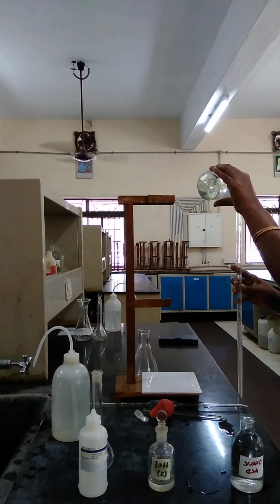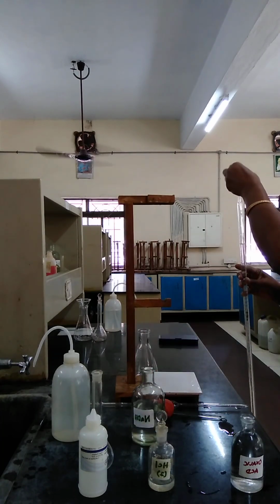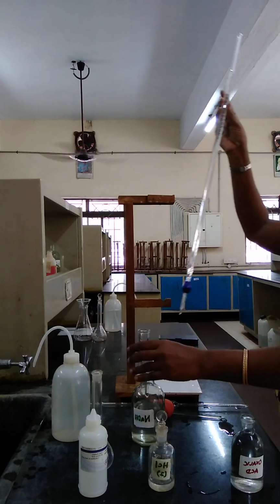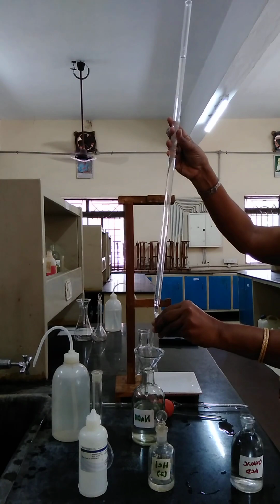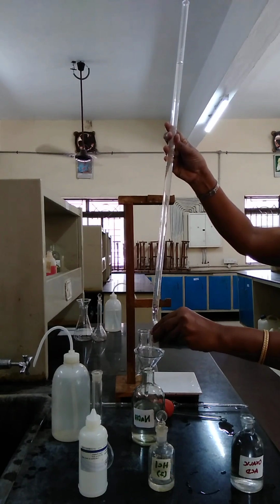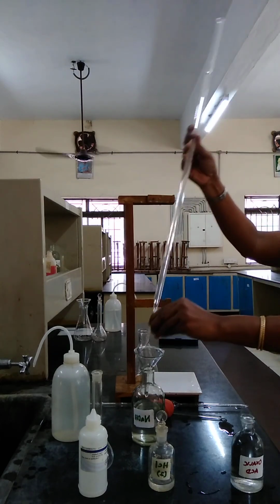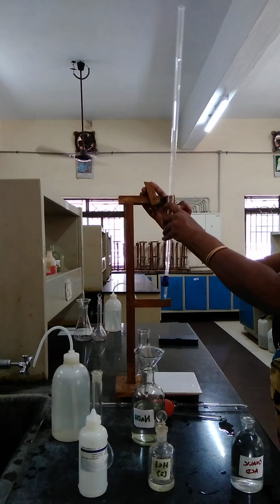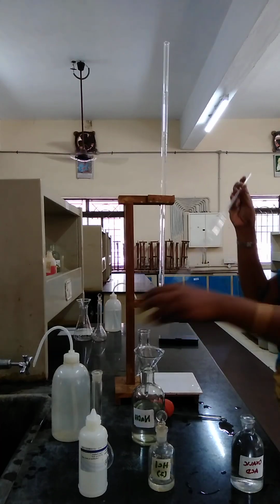of 50 ml. Okay. Once we fill excess sodium hydroxide, then we have to drain through the knob to fill the portion after the knob, whatever the glass tip is there. That portion also is supposed to be filled with the sodium hydroxide. Then only the volume which we are measuring from the burette will be correct.